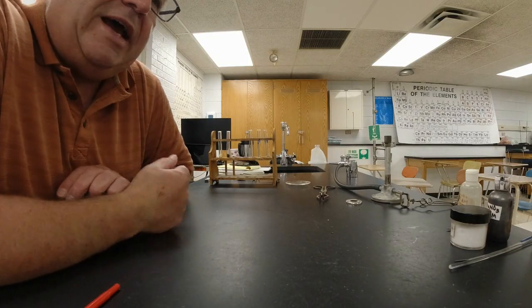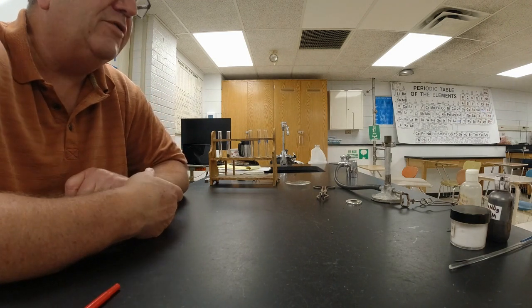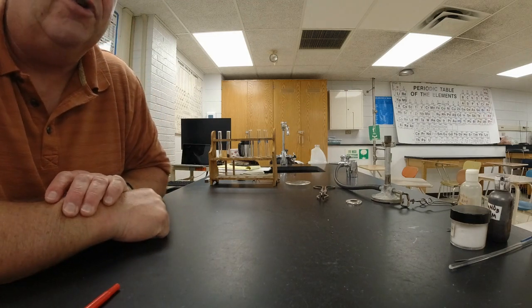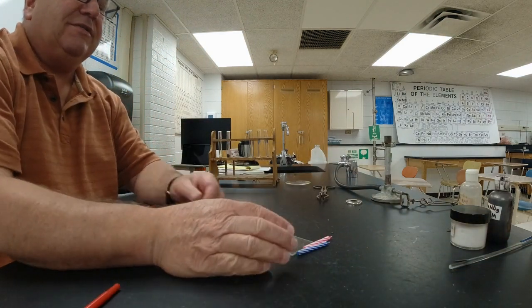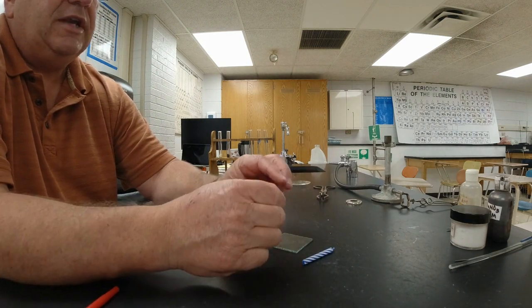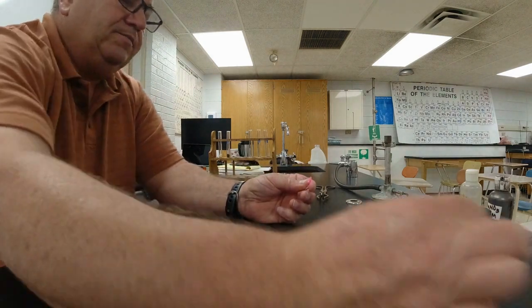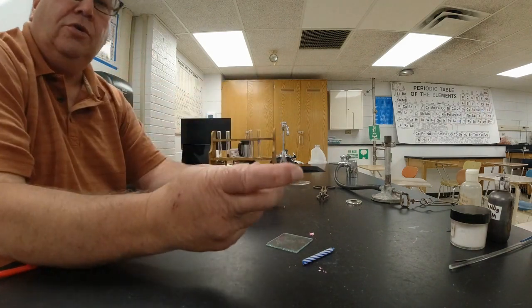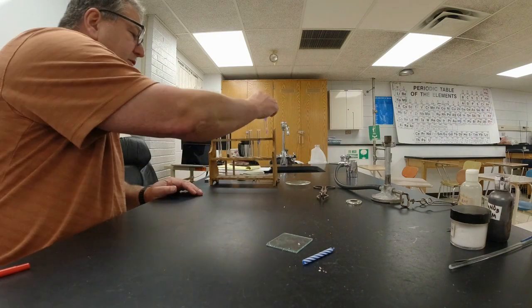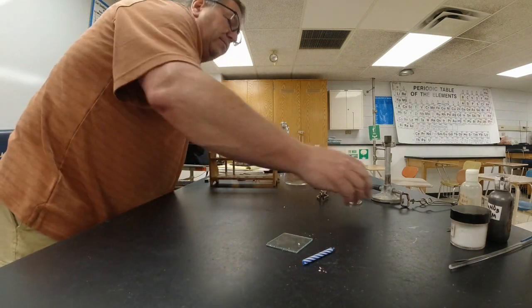Step number one in the lab, if you look at the procedure, we have to be careful. We have flame, we have some acid, things could get hot, so we have to be careful in this. In the first part, it says to break off a piece of a birthday candle. I got a lovely pink and a blue birthday candle here. I'm going to take the pink one, break off a chunk of it, pull the wick out, and put that into a test tube. And I'm going to put that back in the test tube rack, and I'm going to start my Bunsen burner.